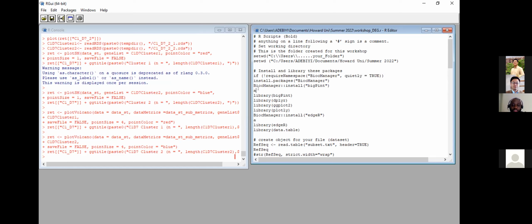And then the same applies to edgeR as well. Once you're done installing, it's going to prompt you to update the edgeR package, so you might want to choose the A as well. I hope that fixed your error. You might want to try that again and see if it fixed that. If it doesn't, I guess we'll probably have to settle that in the breakout rooms.